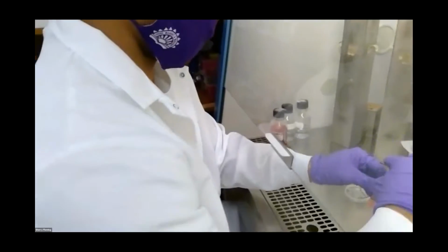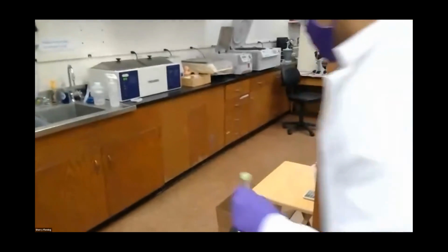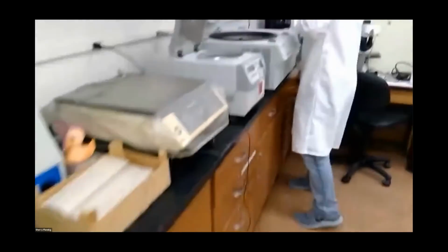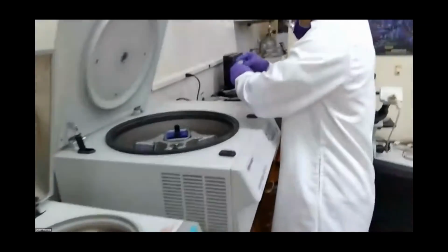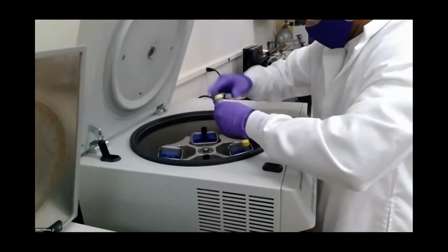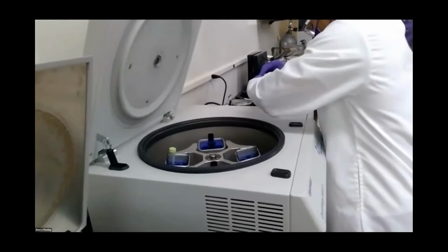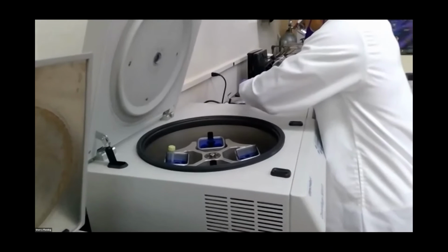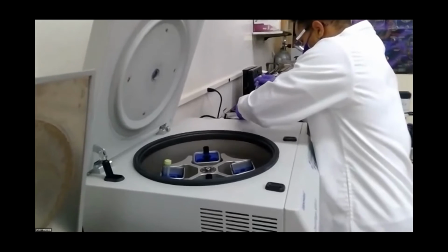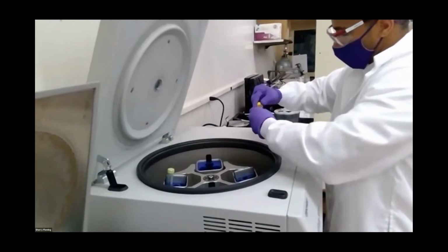So during that time, do you have any questions? If you do, either unmute and ask or type it in the chat. He's balancing the tubes with a balance tube, and then he will centrifuge it.